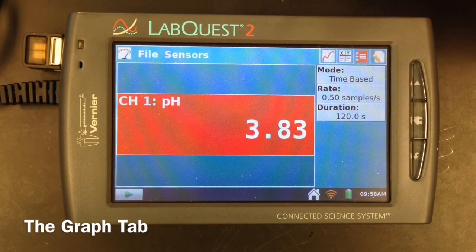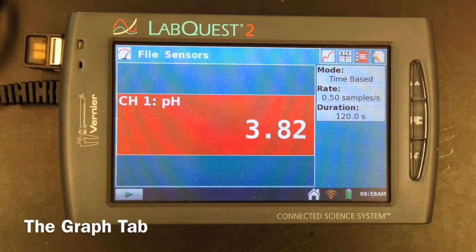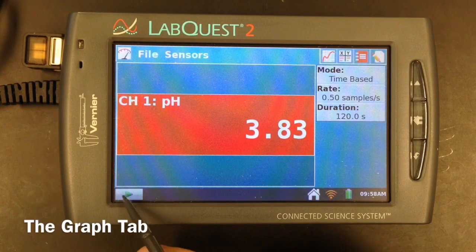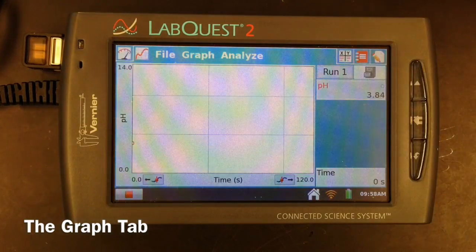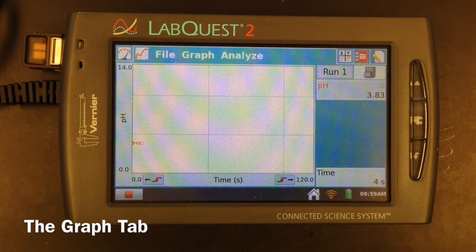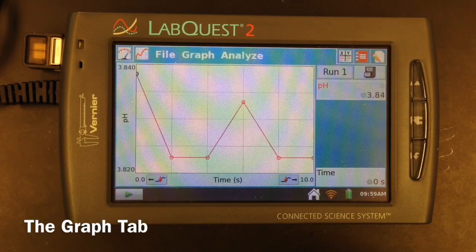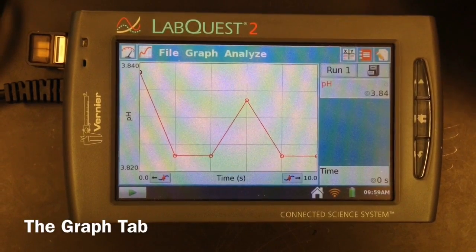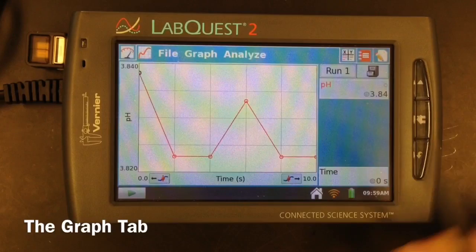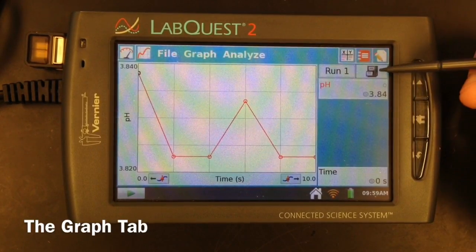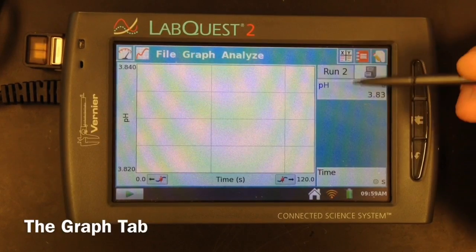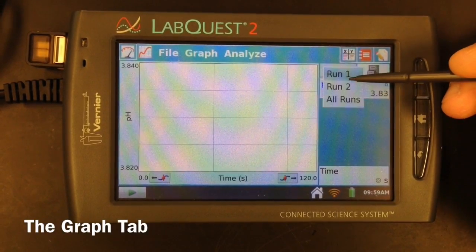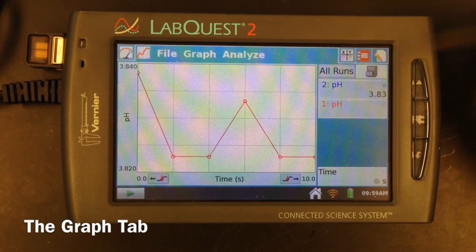The next tab is the graph tab. You can either select the icon at the top, or if you press the start button in the bottom left-hand corner to start collecting data, the app automatically transitions to this tab. The graph is live updating with the data from the sensor. This one was set for 120 seconds, but if you don't want it to run that long, you can press the stop button to end data collection. The graph will usually auto-zoom to any relevant data collected. If you press start again, it would overwrite whatever you collected, unless you click on the file cabinet, which creates a second run. You can then transition between runs or view all of your data collected.